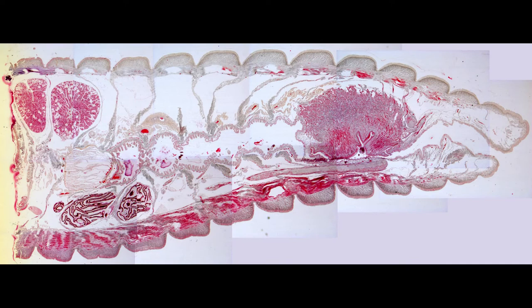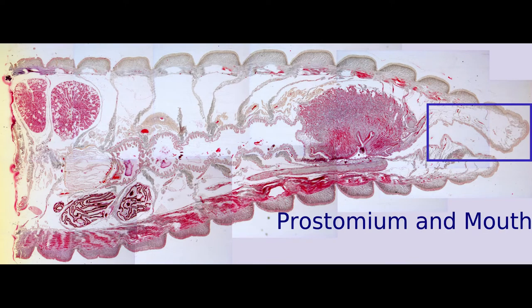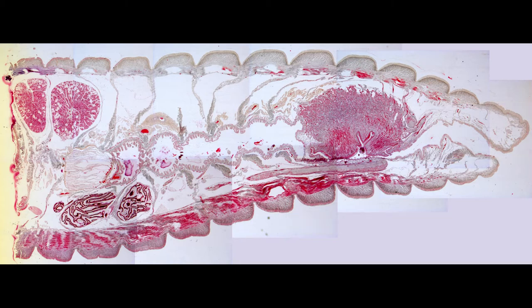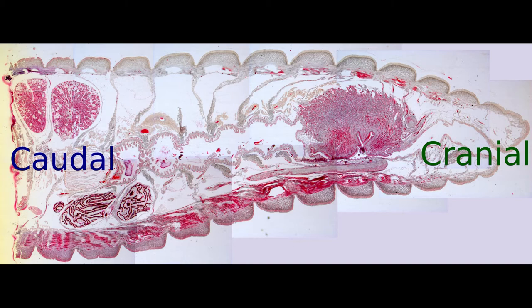On the right we can see the earthworm's prostomium and mouth. As in the transverse section, there's specific terminology for orientating ourselves. Towards the right would be cranial or towards the head, whilst the left side of the slide would be caudal, moving towards the tail.